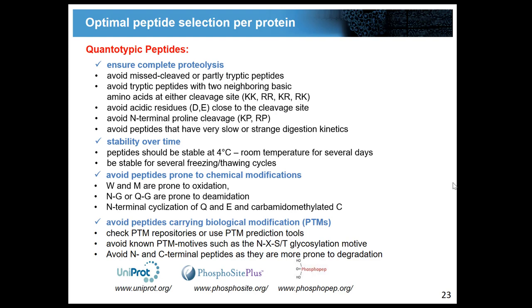Even if your peptide gets oxidized on the methionine to 80%, as long as this is the case over all the samples you compare, your relative ratio will still be correct. And it's a big question how you control this and how you're sure, but if you keep all the samples you would like to compare close together and treat them the same way, I think it is quite valid to say that you can account for some of these things.